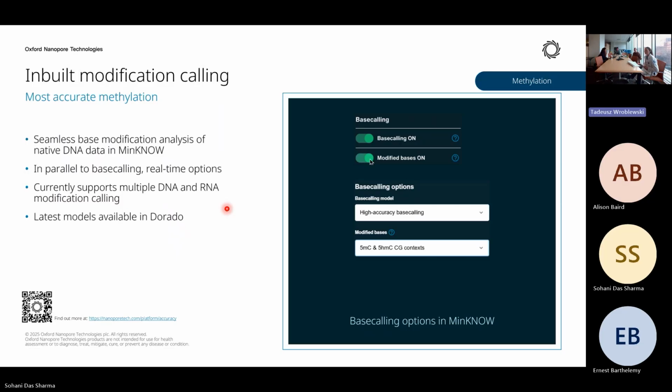Yeah. So for that, the software is called Dorado. We need to use standalone Dorado, and I think tomorrow, let's see how the run goes, I would like to install that as well. At least just for learning purposes, let's do one Dorado run with the modification calling on, then you know how to do it.